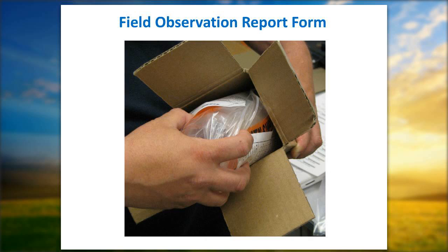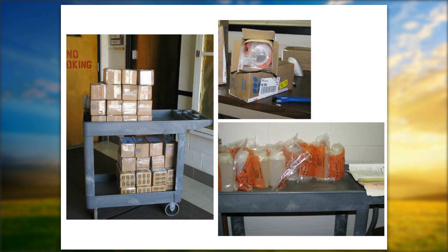We're getting the sample all ready to go. We've got our field form completely filled out. Keep the pink copy for yourself. Make sure that the lid's on tight to the sample. You've got the bag marked. We're getting NTN sites. You can see that the way it comes in is processed. When it comes in the door, it is entered and the process begins the minute it comes in the door.